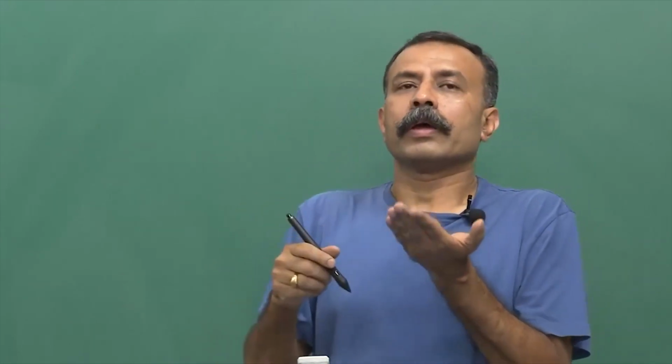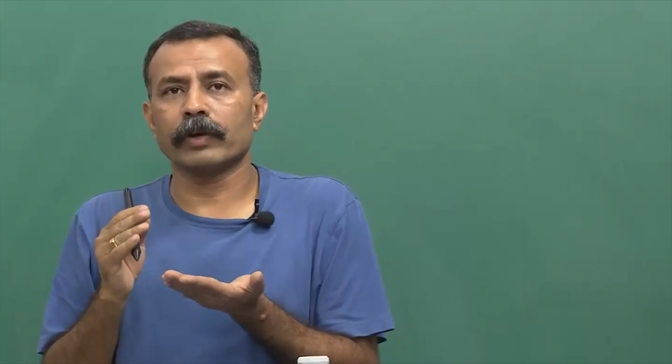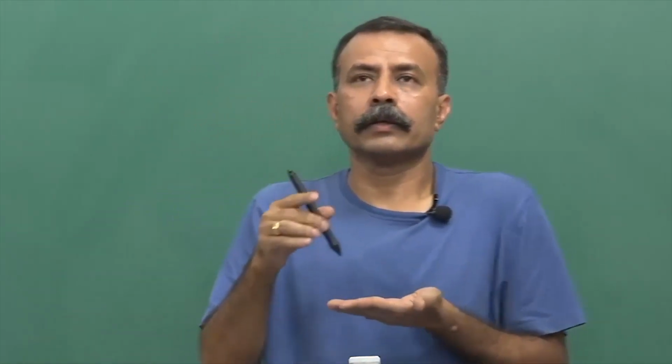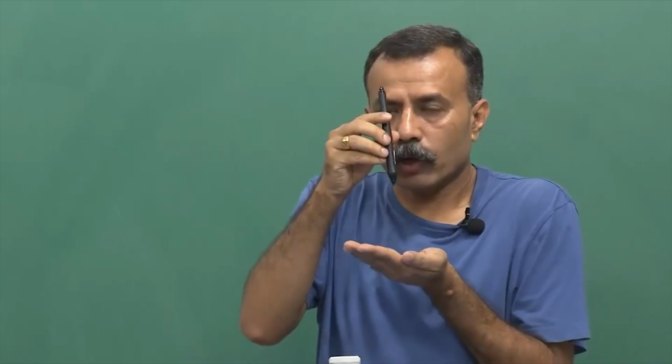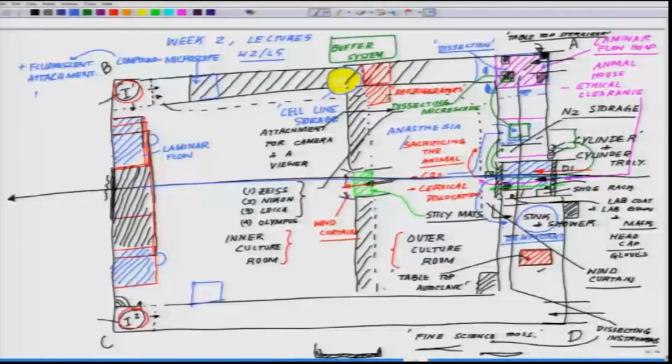Now when we talk about an upright microscope, those who have used a microscope and those who haven't, you have the basic knowledge that in school you must have read that it has an objective. So let's put it like this. You'll have an eyepiece, you'll have a source of light, and you have an objective, and you have a couple of assemblies of lenses. Do not worry about that. Now through the eyepiece, of course, you are viewing the object.